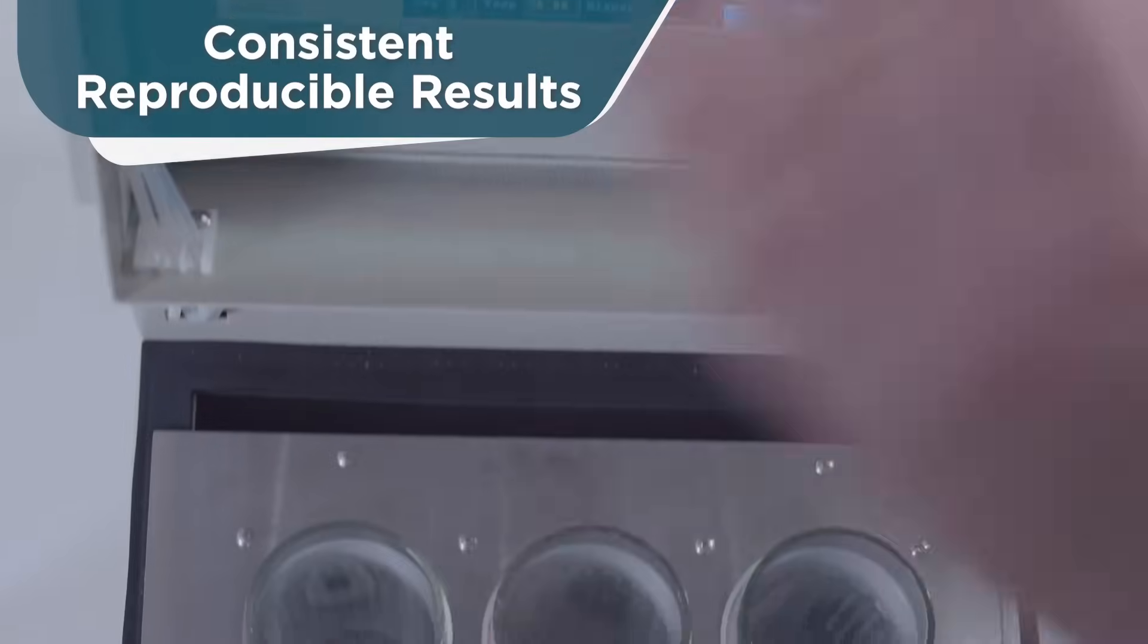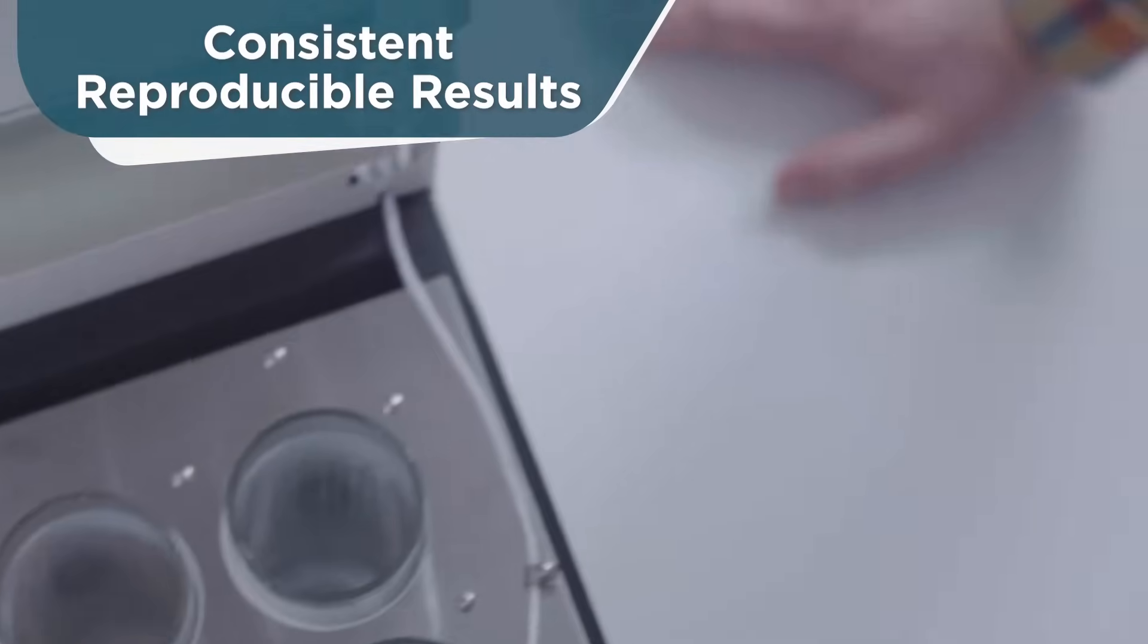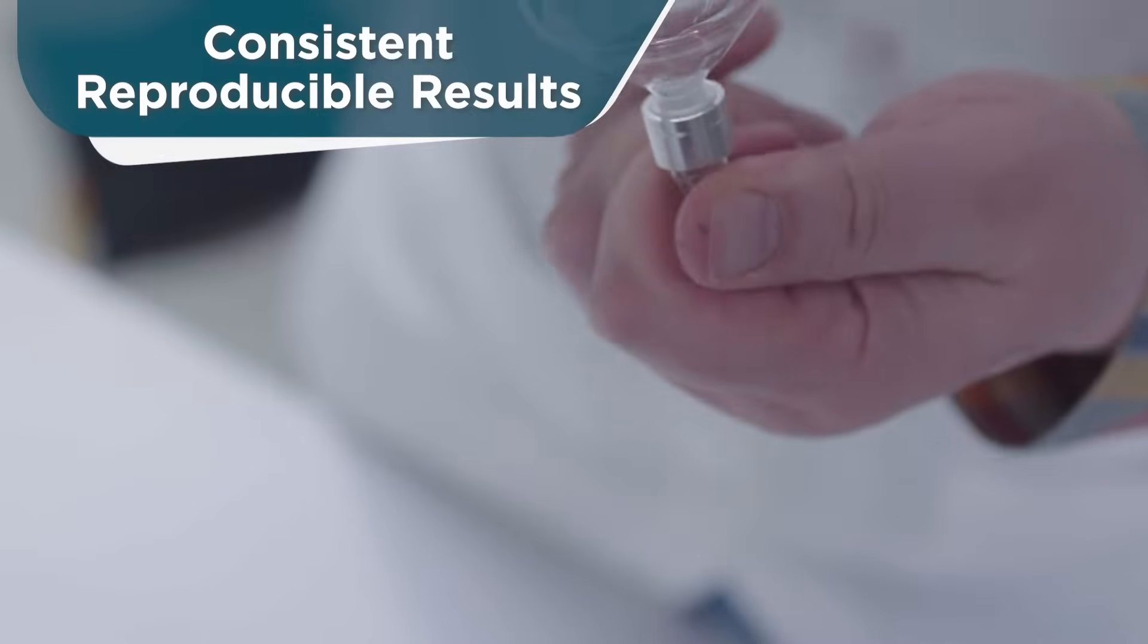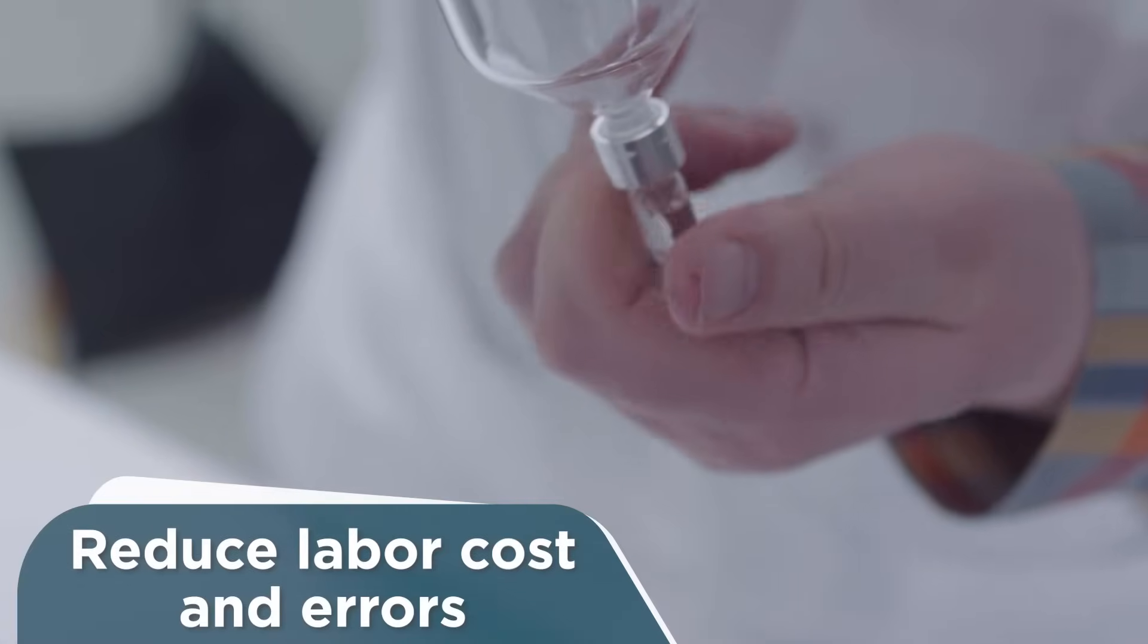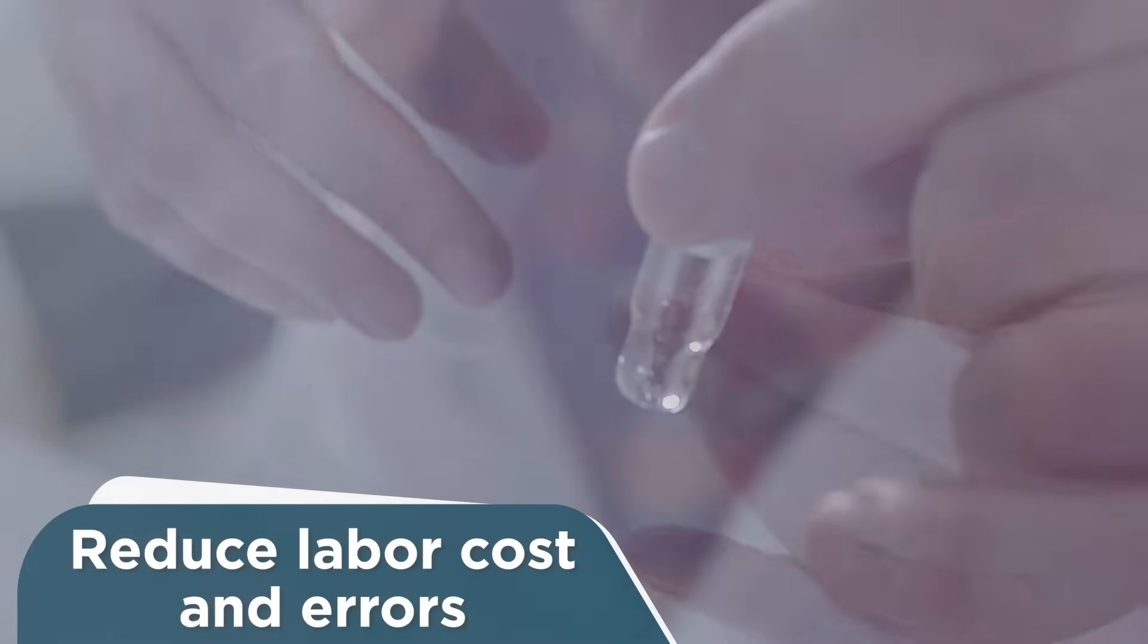The SupraVap with direct-to-vial concentration, automatic endpoint detection, and automatic nitrogen shutoff and alarm for each vessel lowers labor costs and errors introduced from sample handling, while increasing throughput.